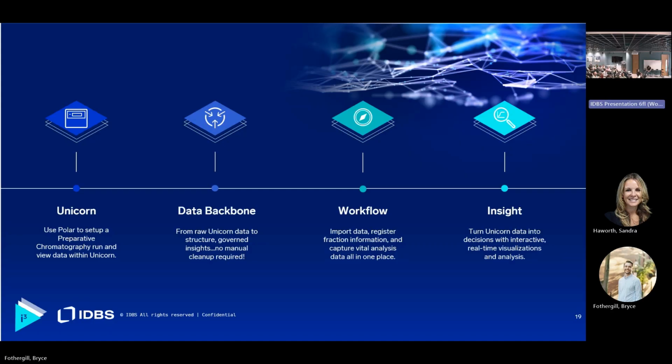So in terms of Empower, we do have an integration currently, but it's not using the OPC connector like you saw with the Unicorn. That is something with the OPC connector. That's why we chose that. And I know Craig touched a little bit on that yesterday. But the idea there is that the Unicorn's the first step. And then after that, we can build on that using that same generic connector, making it easier. And we could do all of this that we just presented with Unicorn with any of those other instruments as well. Thanks. Of course.